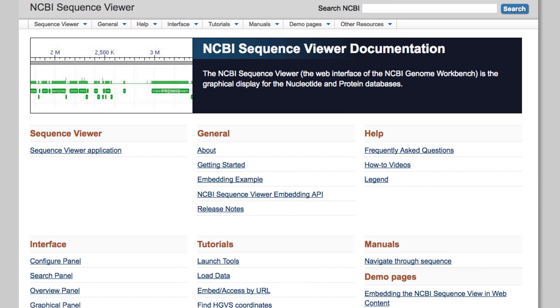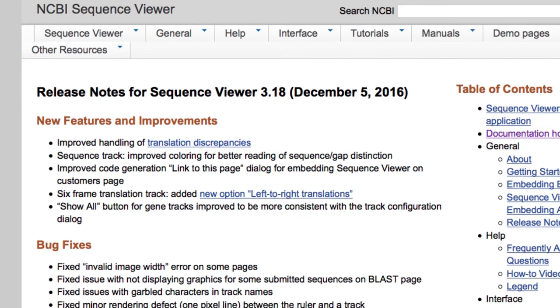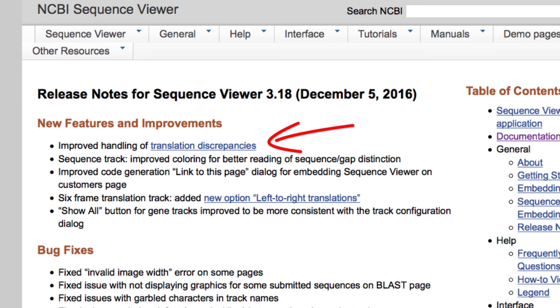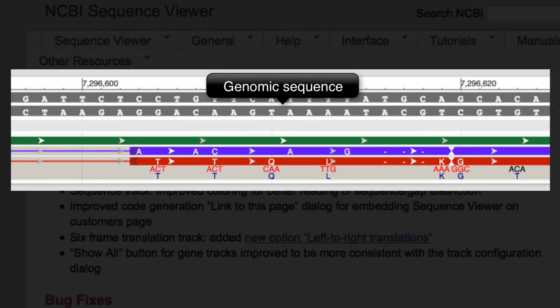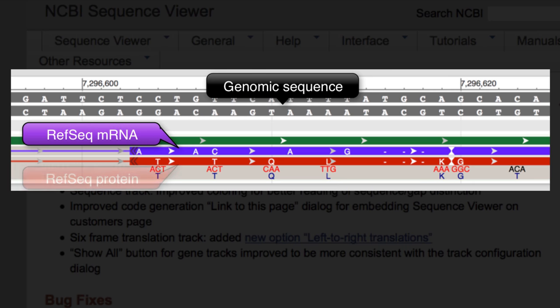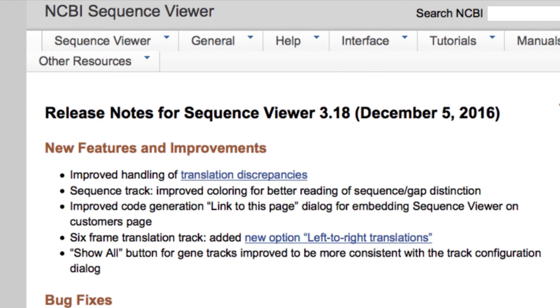Recent enhancements to NCBI's Sequence Viewer can be found in the release notes and include better ways to display discrepancies between genomic sequence and annotated features. These discrepancies can occur because RefSeq gene models, based on the current genomic sequence, can differ from RefSeq transcripts and corresponding proteins that come from our continuous curation efforts. Let's look at a few examples of the new rendering for such discrepancies.